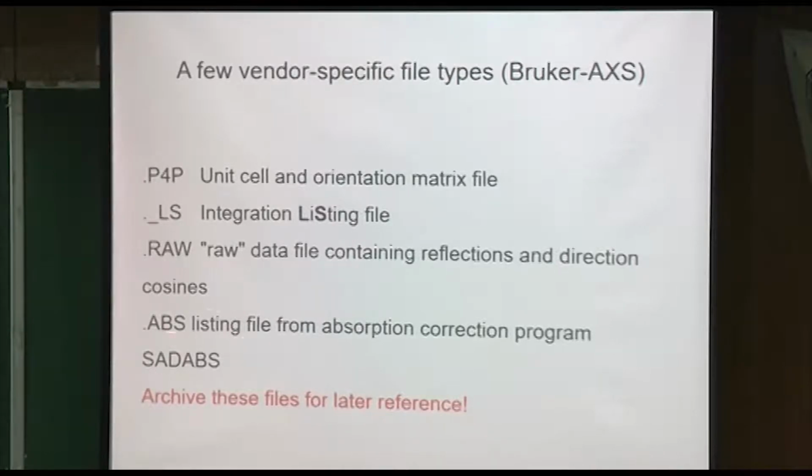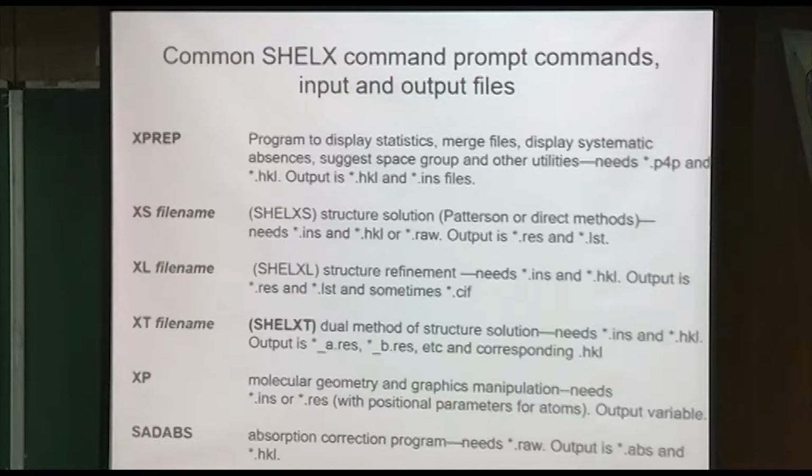I keep the ABS file. You need that to finish your CIF, so keep that one. So when you get down to having to write your CIF, you make sure you have all these handy. Don't throw them away.